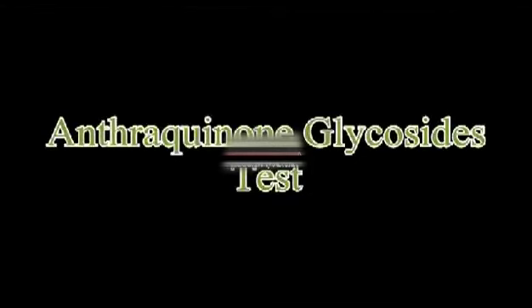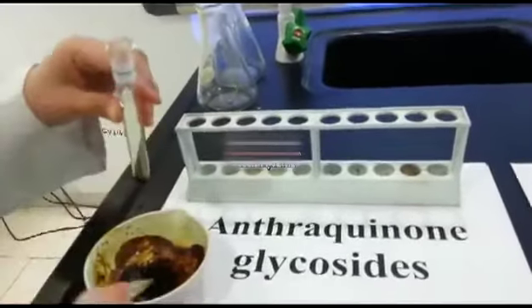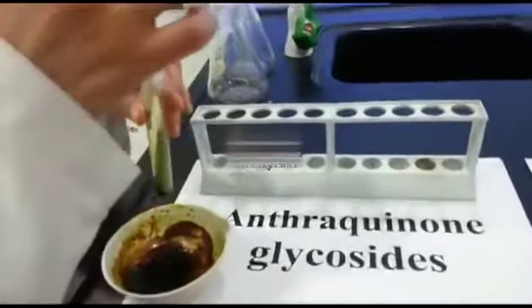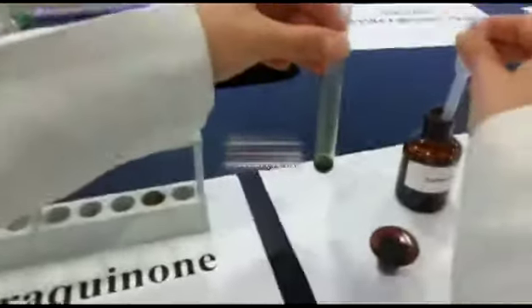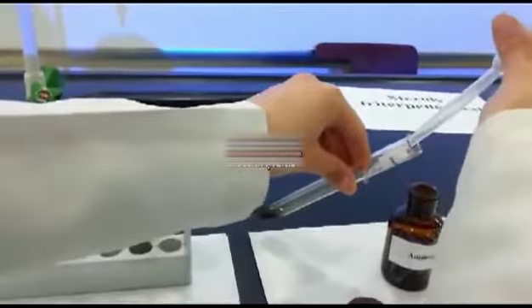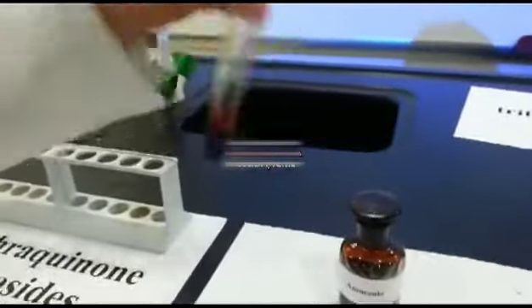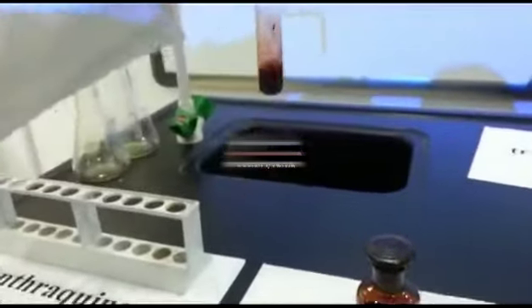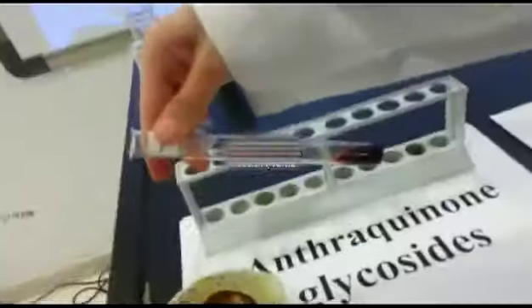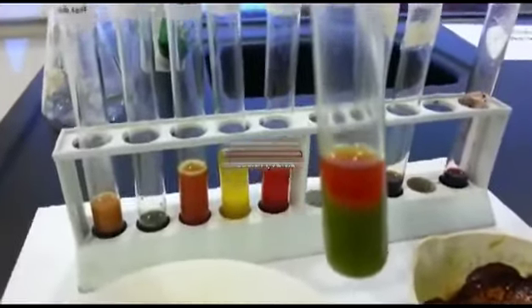Then the anthraquinone glycoside test. We take 2 ml alcoholic extract and 1 ml ammonia, and shake it well. The presence of a rose red color will show a positive test. You can see here the rose red color on the top that will show a positive test.